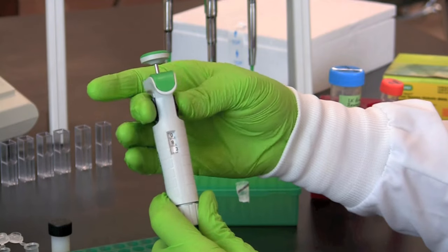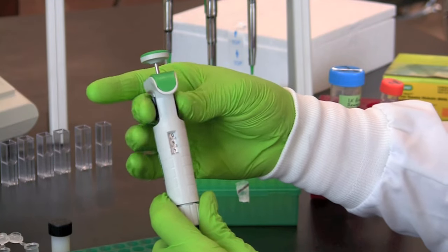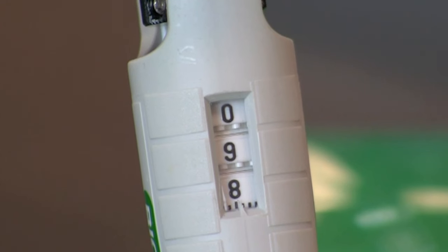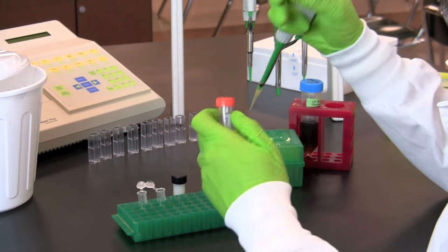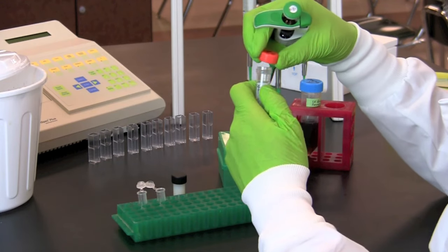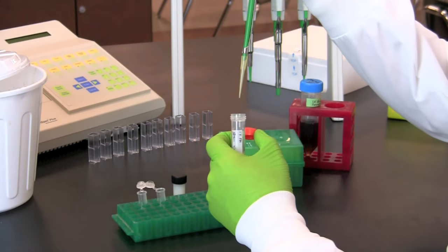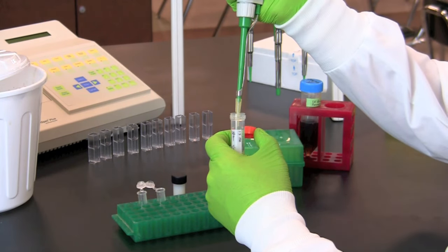Using a 20 to 200 microliter micropipet, set the pipet to 98 microliters. Pipet 98 microliters of 1x PBS into an empty microcentrifuge tube labeled sample.